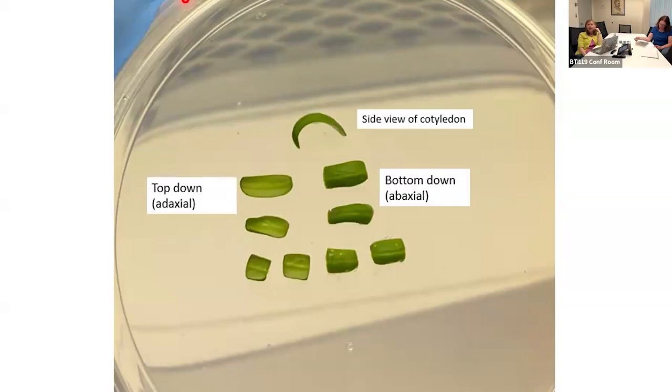But I know it can be an issue with seeds, especially if you're working with maybe a wild species. That can happen sometimes, or with some other species where there hasn't been a whole lot of breeding and selection for lines that do have even germination. So, but that's something that could be tried.